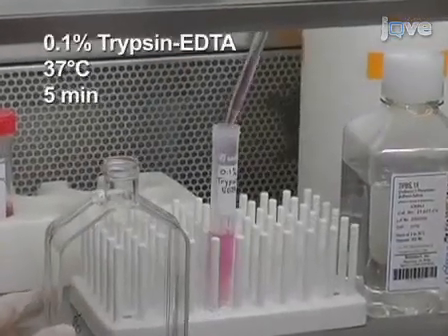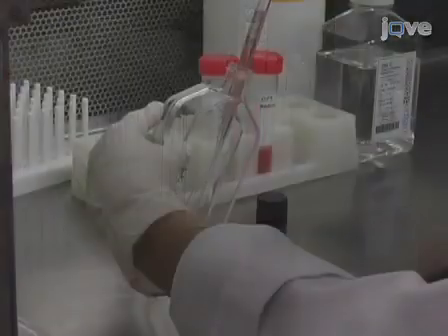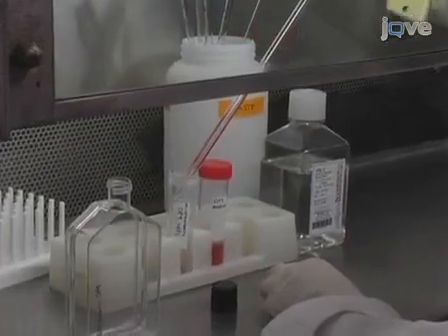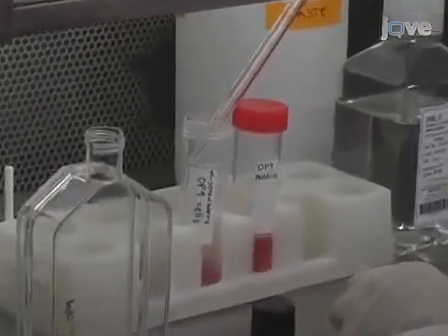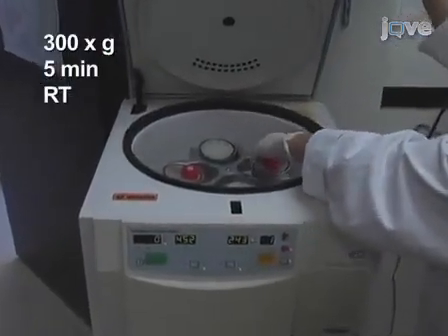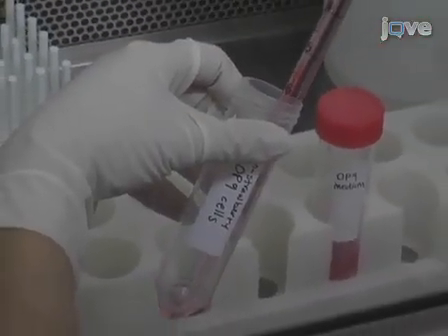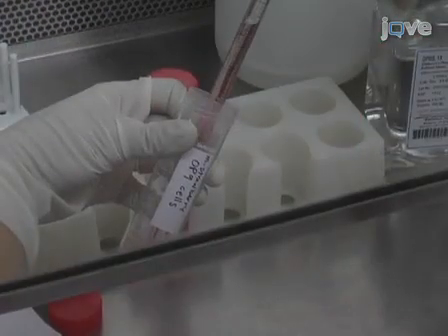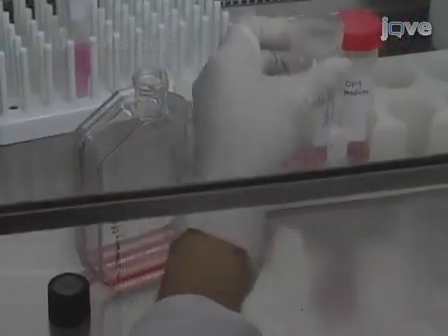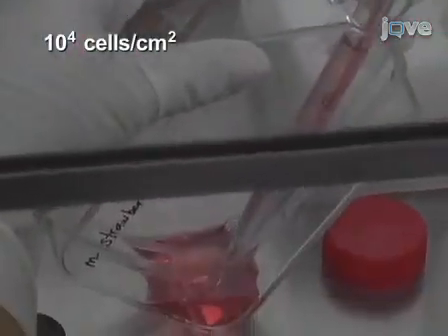Then add pre-warmed 0.1% trypsin EDTA for 5 minutes. When the cells have detached, add OP9 cell culture medium and transfer the cells to a 50 ml conical tube. Pellet cells at 300 G for 5 minutes at room temperature. After centrifugation, discard the supernatant and resuspend cells in fresh M-strawberry OP9 cell culture medium. Plate cells at a minimum density of 10 to the 4th cells per centimeter squared.